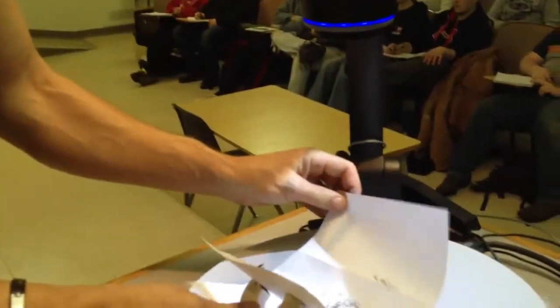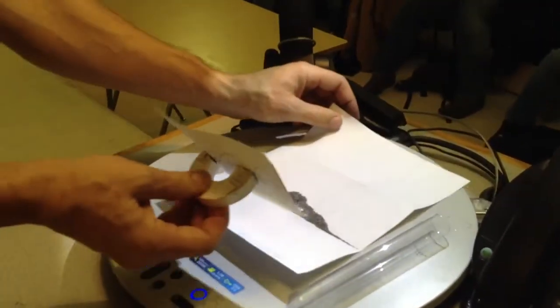Let's pour this out. So, let me see what you got there. You see that now, and you see this.